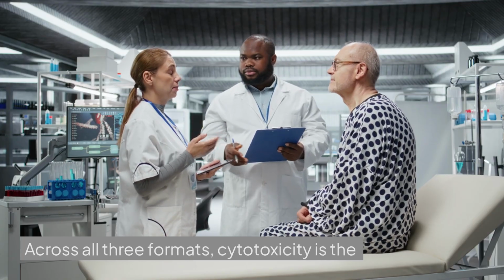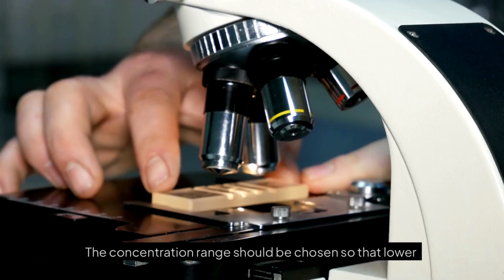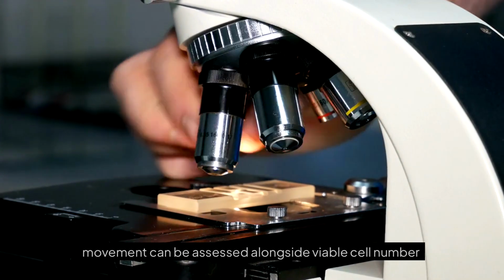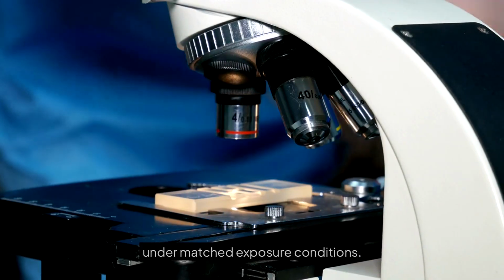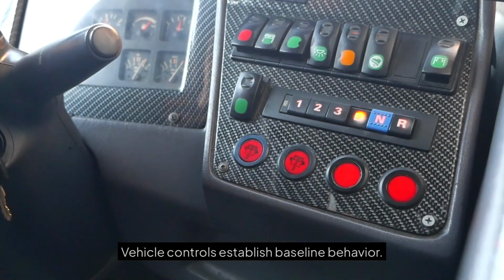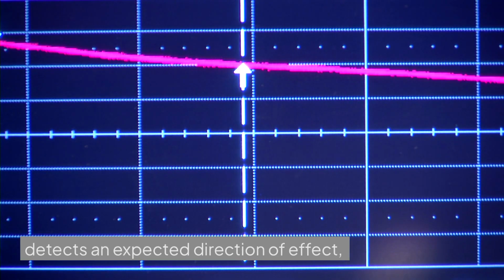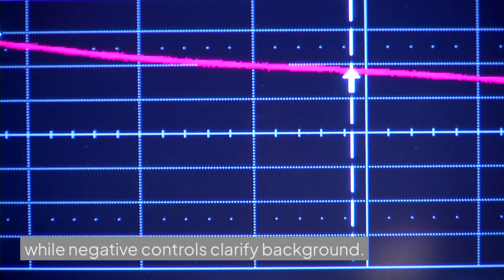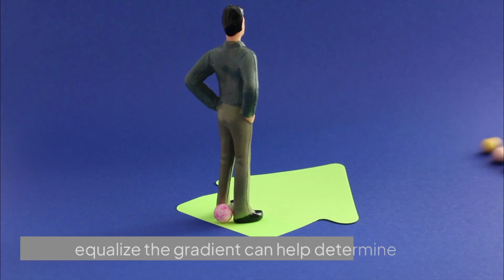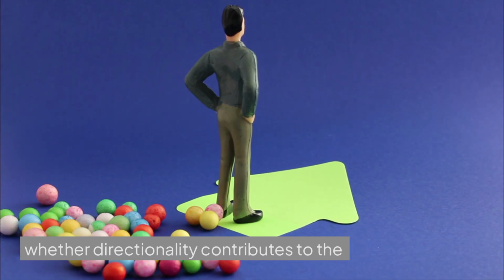Across all three formats, cytotoxicity is the central interpretive risk. The concentration range should be chosen so that lower movement can be assessed alongside viable cell number under matched exposure conditions. Vehicle controls establish baseline behavior. Positive controls confirm that the system detects an expected direction of effect, while negative controls clarify background. For chemotaxis, conditions that remove or equalize the gradient can help determine whether directionality contributes to the result.